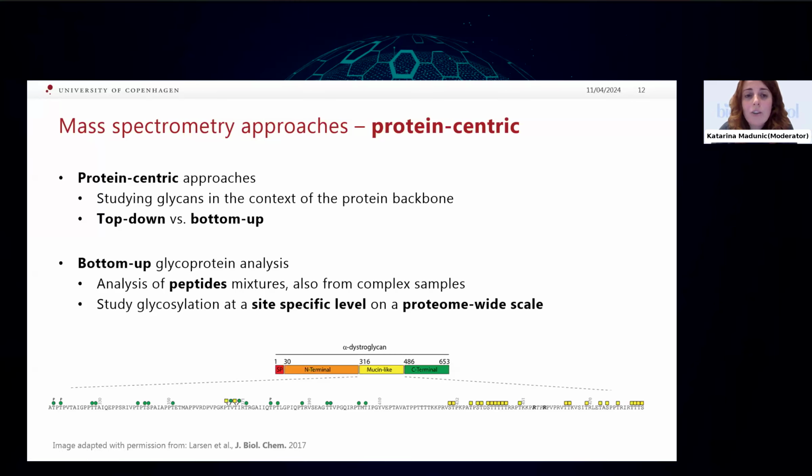So in this way, not only do you preserve the sialic acid, for example, during mass spec MALDI-TOF analysis, but you also can get a little bit more information on the actual linkage, which is actually very important, since it's been shown that, for example, 2,6-linked sialic acid is differently expressed in cancer. So this is something that has been published maybe 5 years ago, and it could be a method to preserve very labile sialic acids.